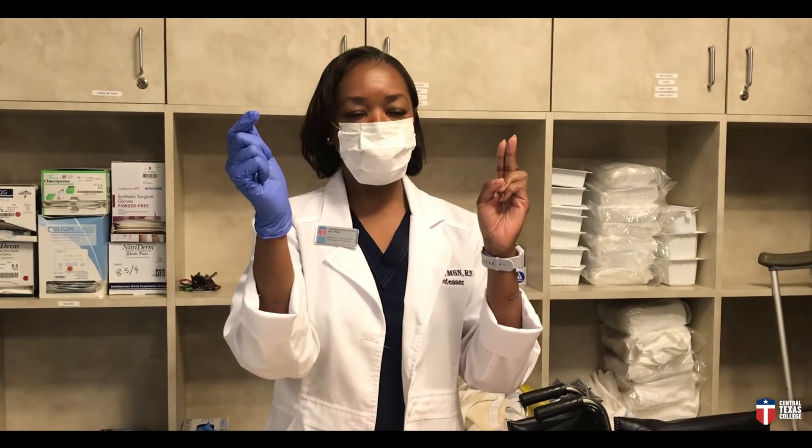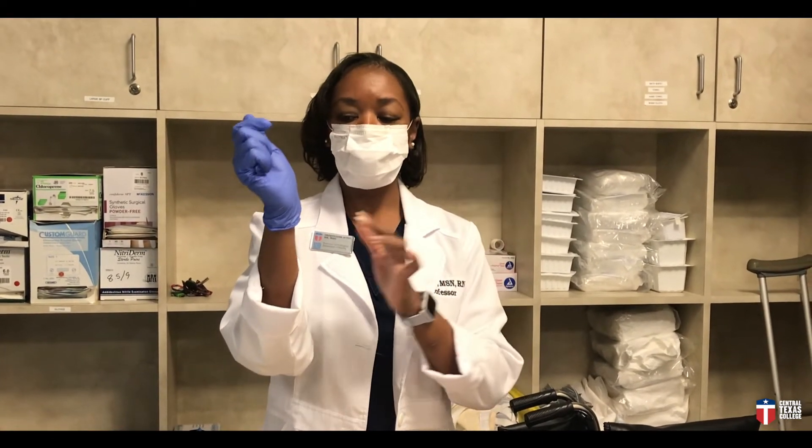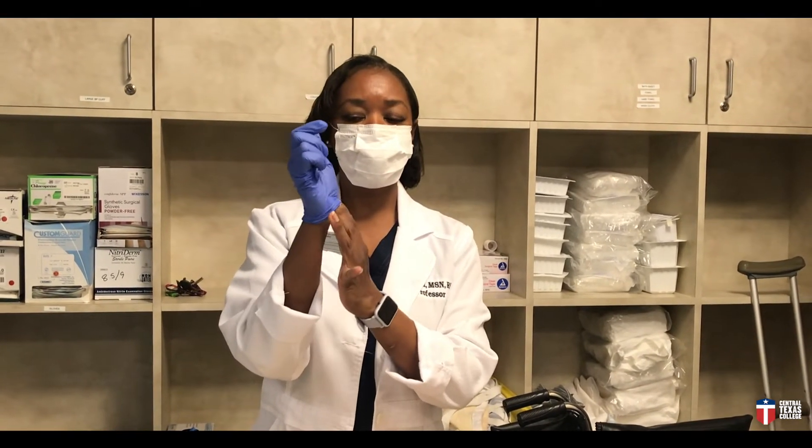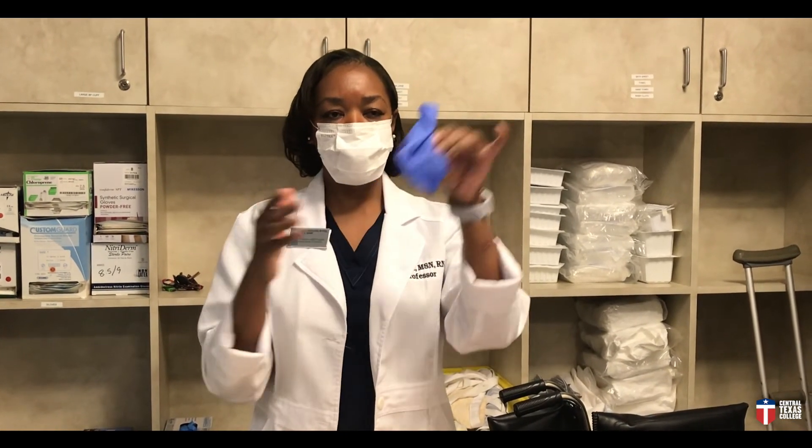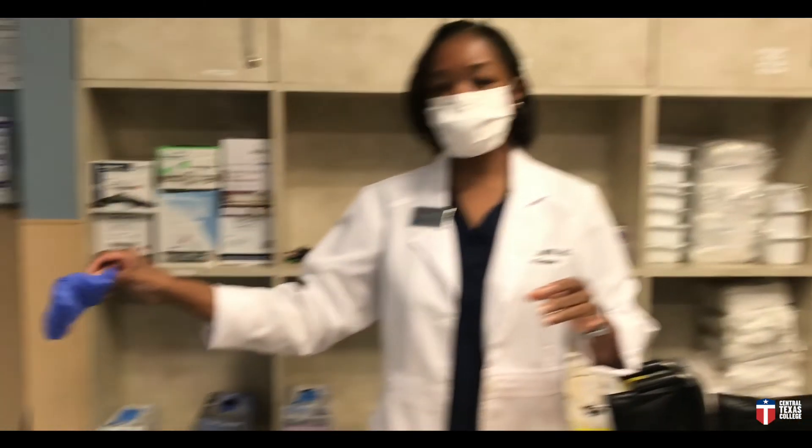Now, with two fingers — or if your fingers are larger, maybe one finger — underneath, you take off the second glove, turning it inside out, placing the gloves inside out on your hand, and then you simply dispose of the gloves.